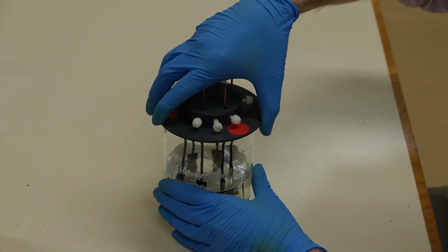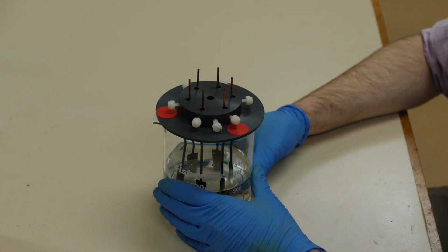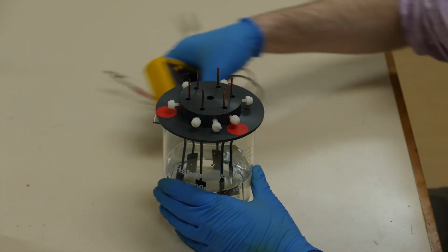Finally, the lid is placed on the beaker, immersing the coupons in the potassium iodide solution.